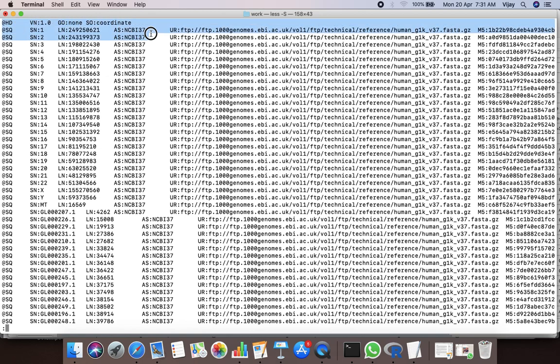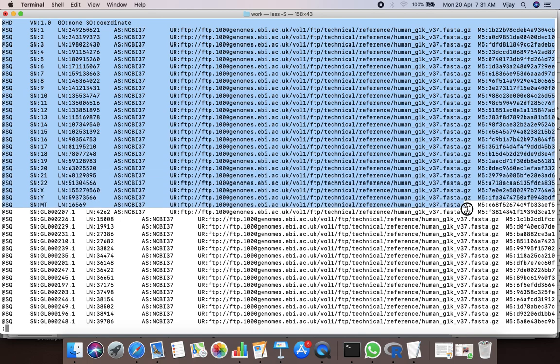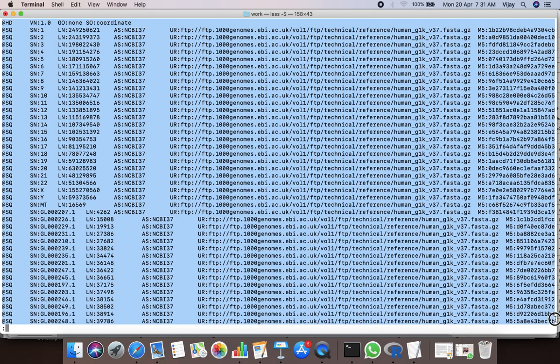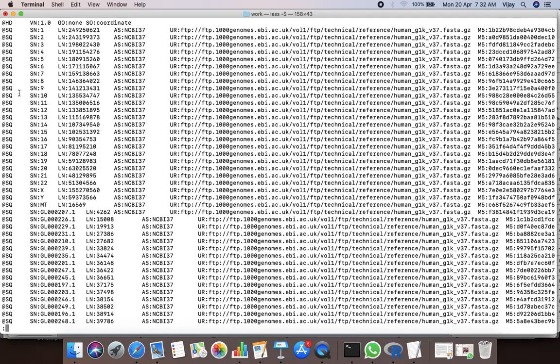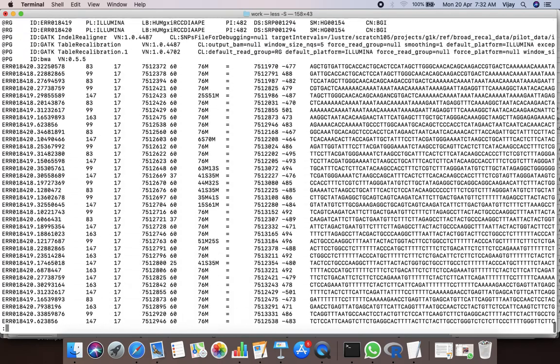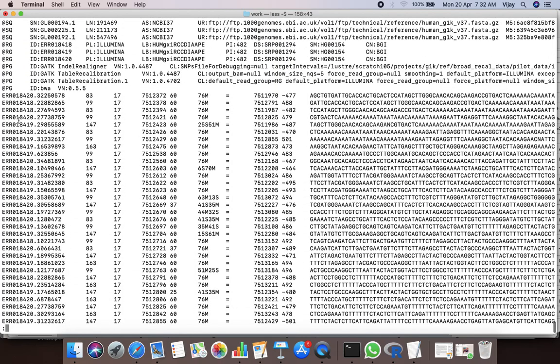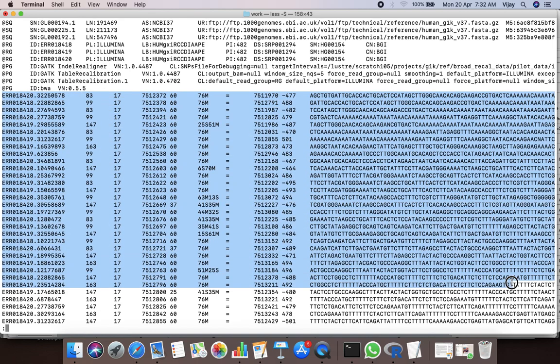Here you can see the first section — the header section of the SAM file. Each line in this section starts with the @ character. After the header section is the alignment section of the SAM file.